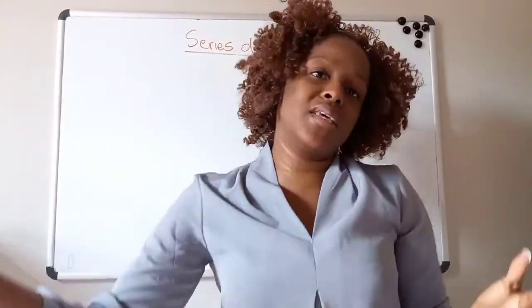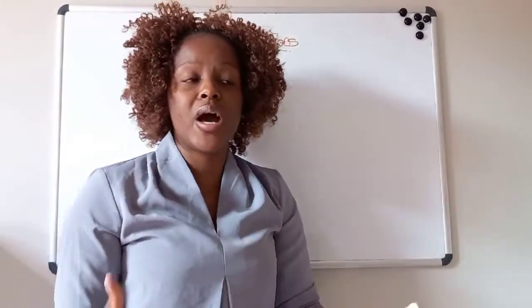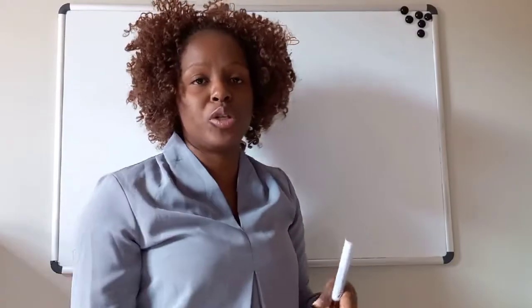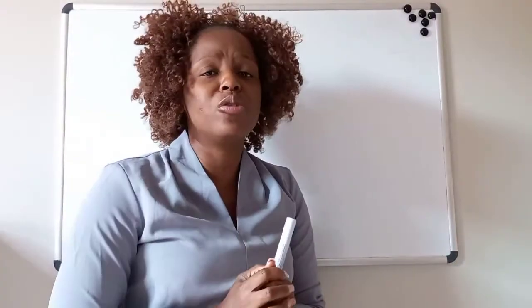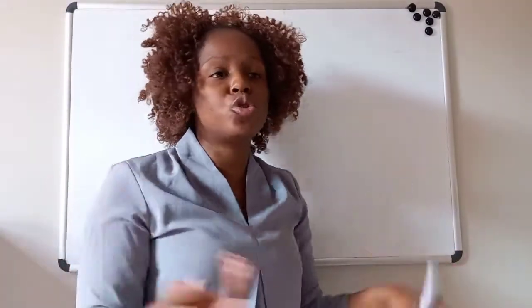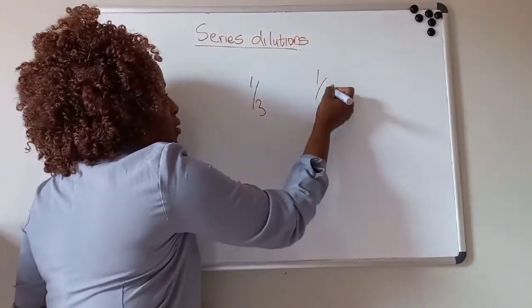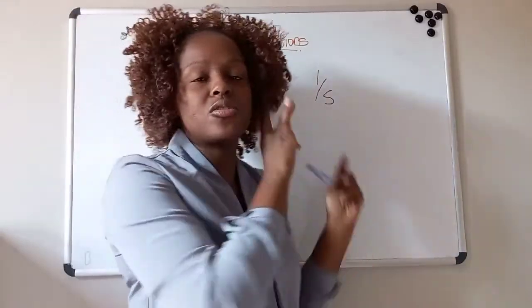That is a series. So usually you can find that maybe you've just received a printout from the instrument and it shows a greater than sign, and now you want to dilute that sample. You decide, or according to your SOP, you do probably a 1 in 3 and a 1 in 5 dilution. So these are the series of dilutions.